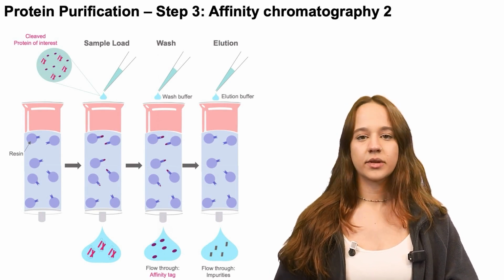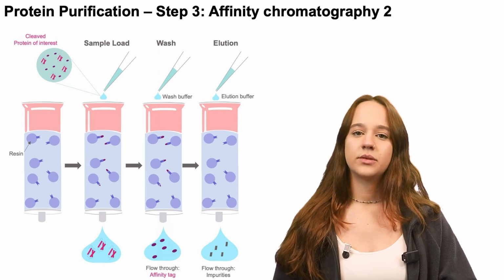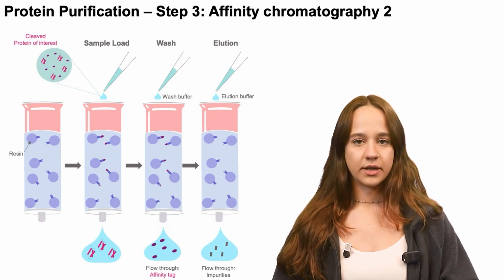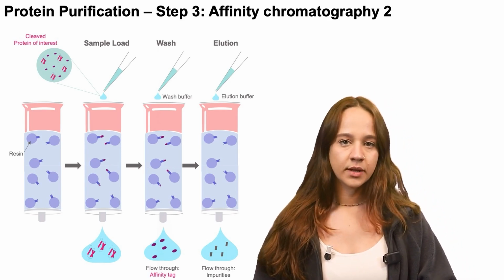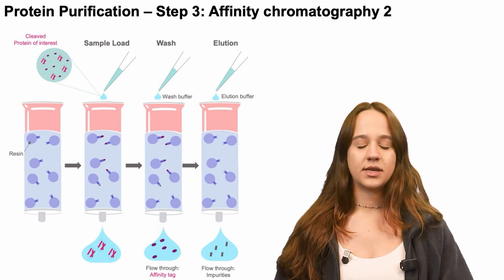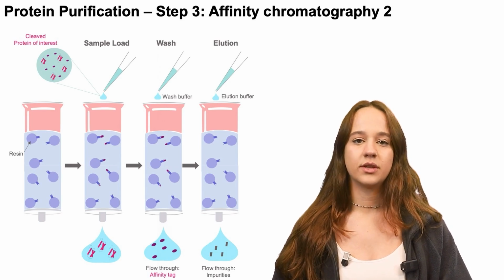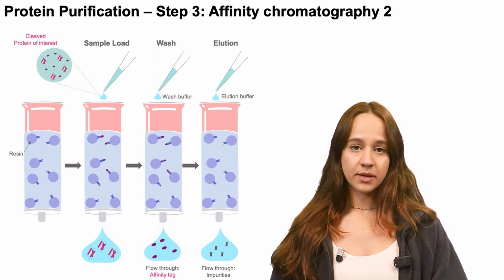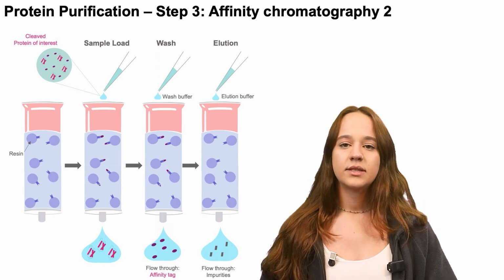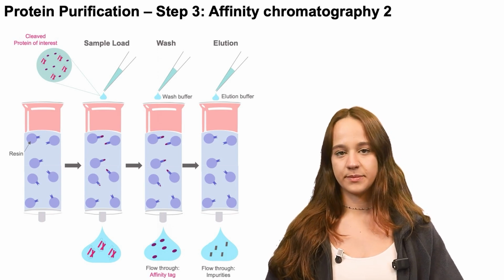This time, since our recombinant protein does not contain a polyhistidine tag anymore, it won't be retained on the column and will fall off in the first collection tube. On the other hand, the his tag, the TEV protease, which contains a polyhistidine tag, and the contaminants from E. coli that bound to the nickel column in the first step will still bind to the column in the second step. So this allows for a very efficient separation of our protein from these contaminants.